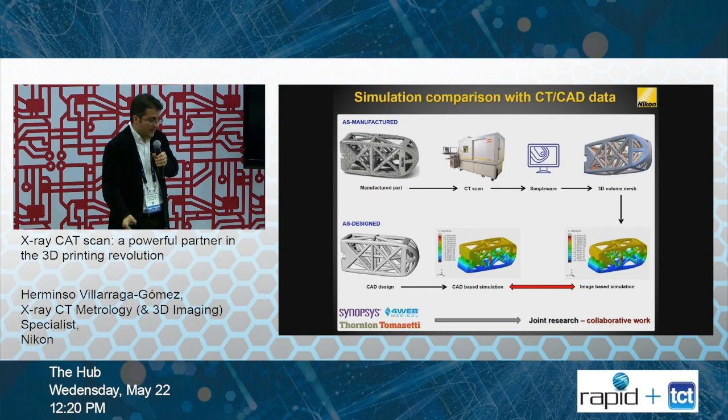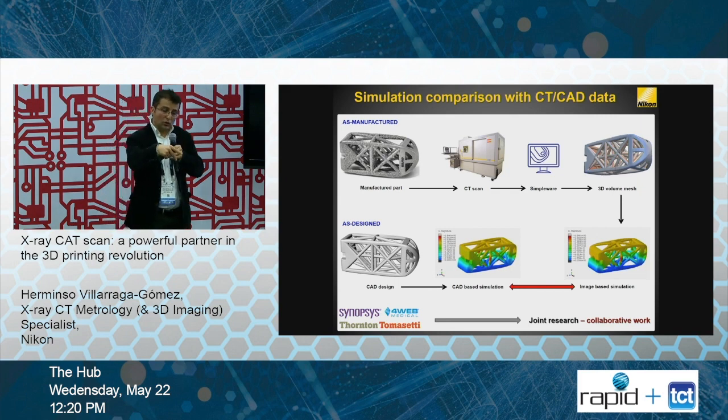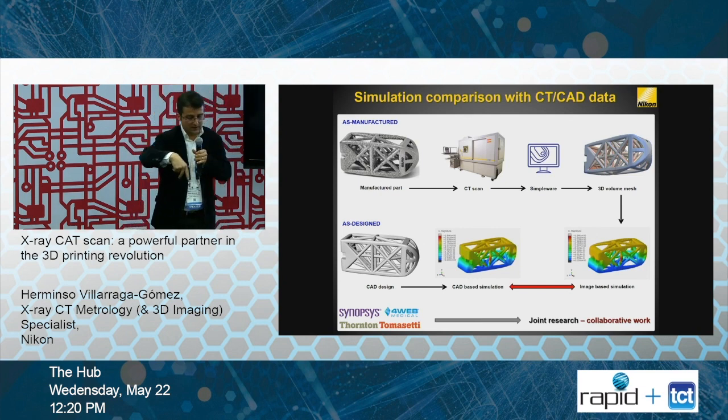For scanning the part, you could do that if you design your system and you put it inside of the machine. It has to be shielded against the X-rays, so you have to do the printing inside of the machine. And as long as the process is slow enough, so when you go at 360 degrees rotation, then you can see the change. So what you do is several scans.